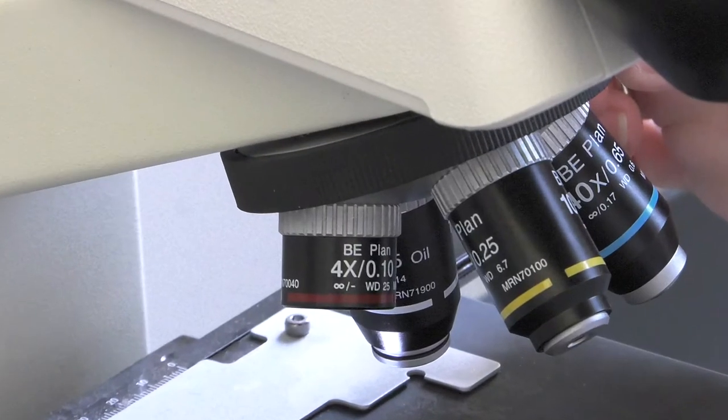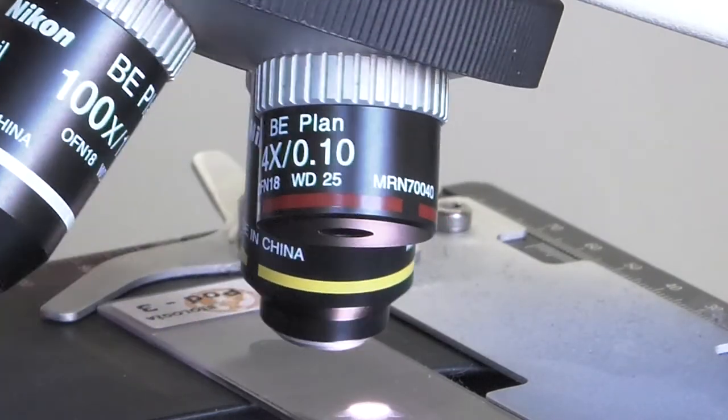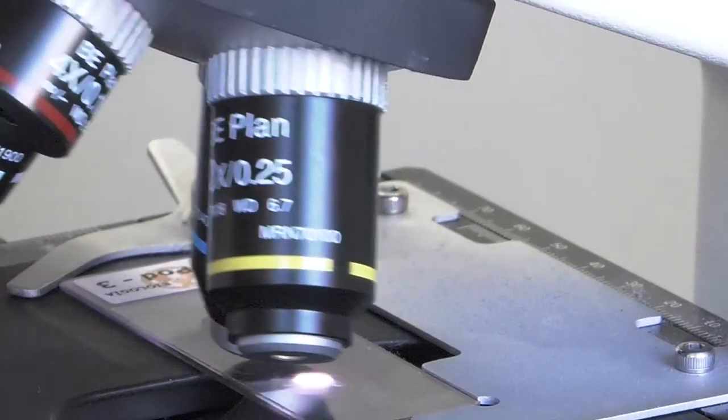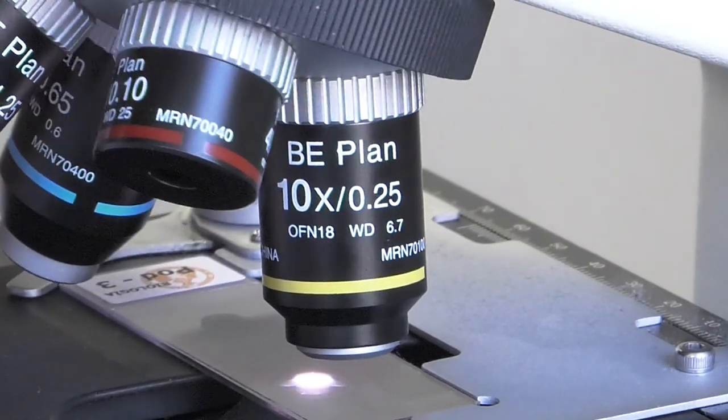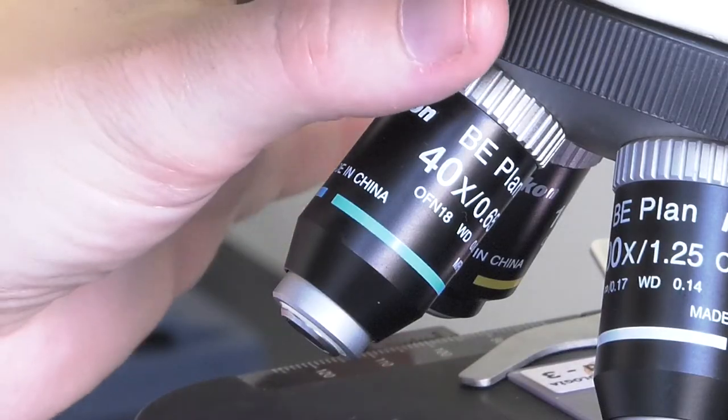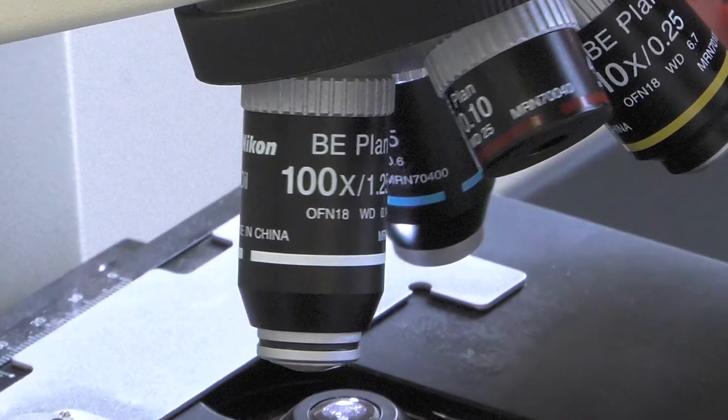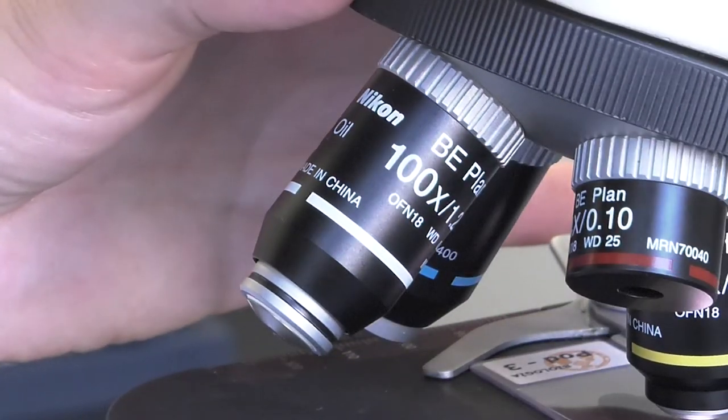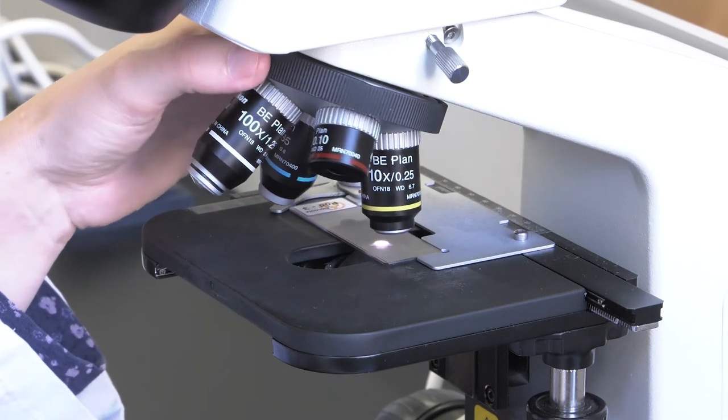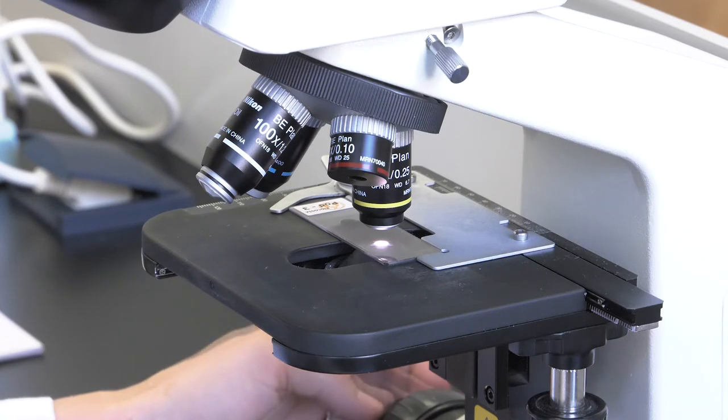The first objective lens, the one with the shortest tube, provides a magnification of 4x for the image size. The second objective lens, with a longer tube, provides 10x. The third objective lens produces 40x magnification. And the last lens produces 100x magnification. In order for the image of the sample to be visible by the observer, the chosen lens must be aligned with the condenser lens.